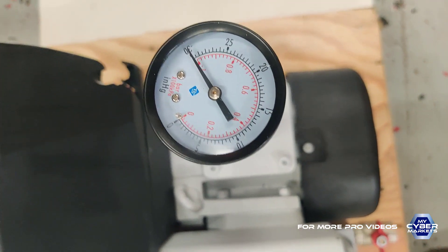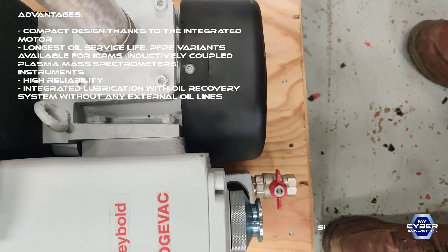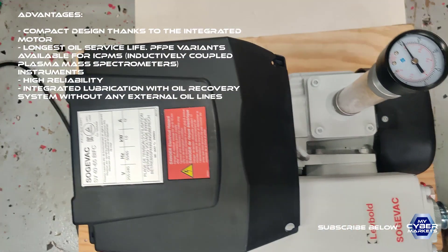It goes to 30 inches mercury vacuum. It's working smoothly.